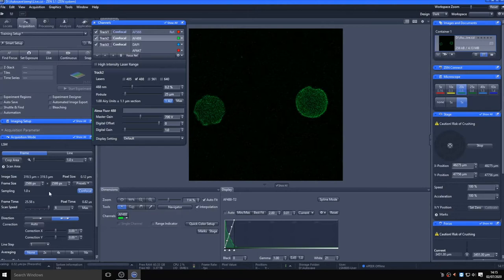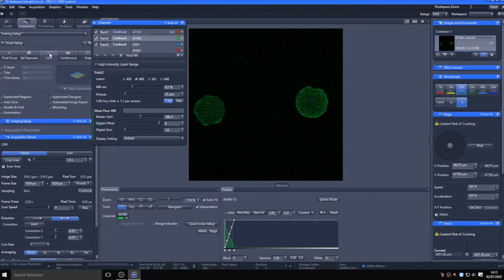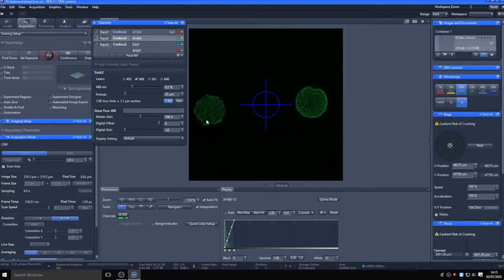In this case, for the 20x lens on this system, a frame size of 2586 pixels squared is required for ideal sampling. Obviously, this will take a significant length of time to image, even at faster scan speeds. So for the purpose of this training, I will reduce the sampling to 1024 by 1024, therefore reducing the resolution of the images captured.